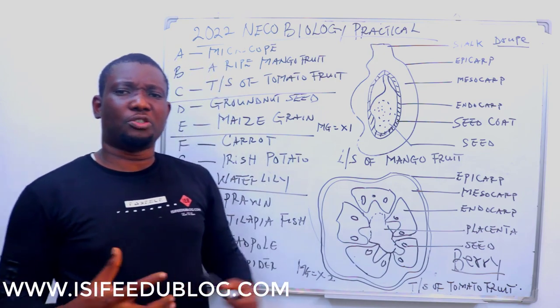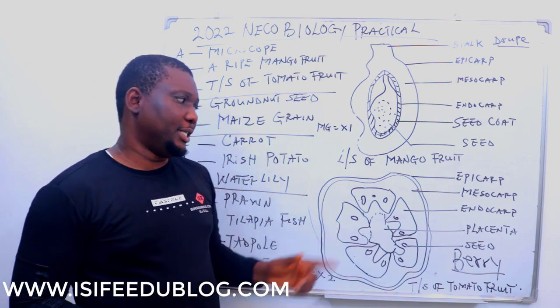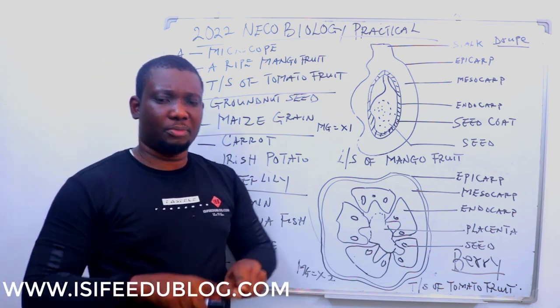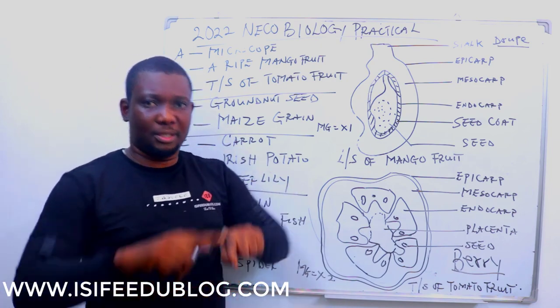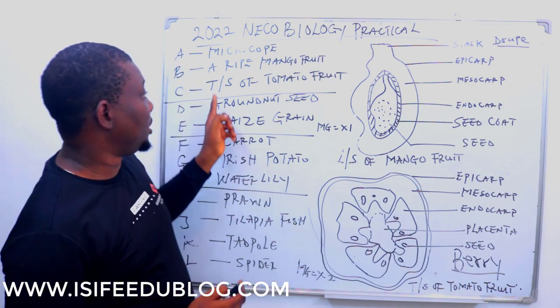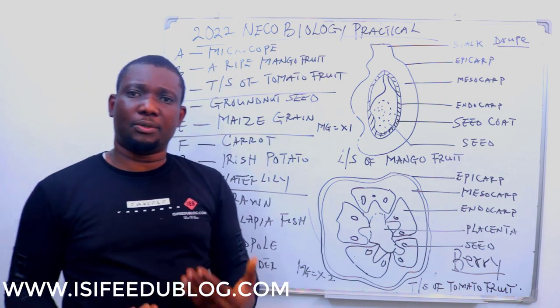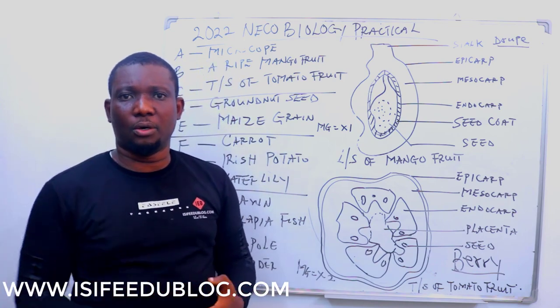And now an analysis of the structural observation of this tomato. As you can see, it has a round shape, so you can assume round. Sometimes you can have a kind of distortion, but the fact remains it's round or circular. Color can come in many forms, but if the tomato provided is a ripe tomato, that means it should be red in color. The examiner wants to find out from the students: give reason why this fruit is red in color.